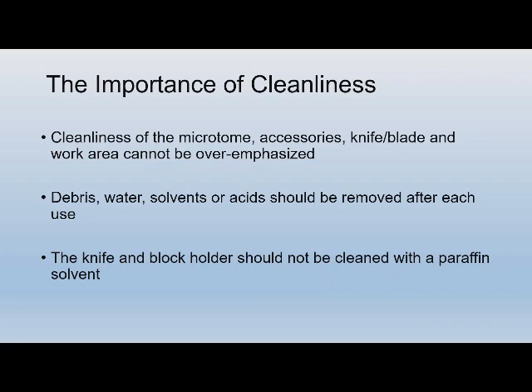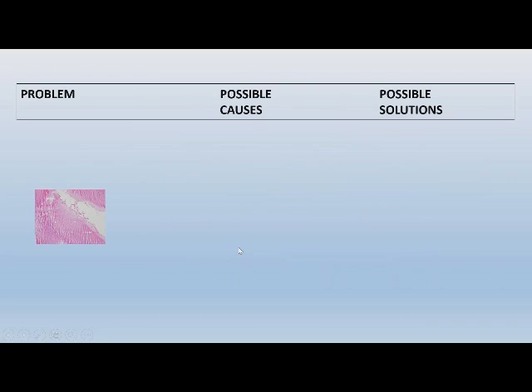And if you leave solvent on it, that's going to be even worse, because you may actually find that it eats into your blocks. So you want to get rid of all that. Let's look at a few problems, causes, and maybe some suggested fixes. We got knife mark splits.